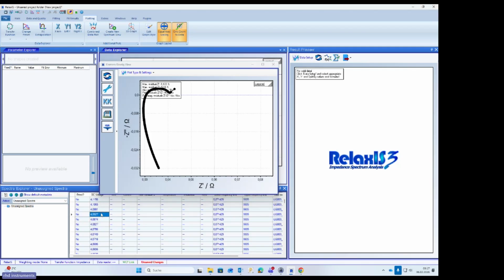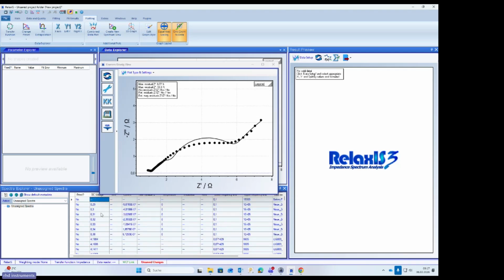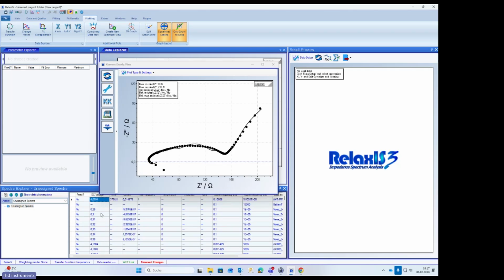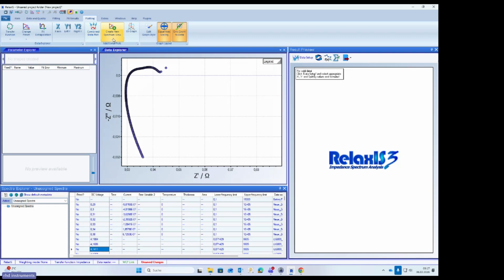And if I go here now through these different data sets, you see here Kramers-Kronig is fulfilled for most of them. Maybe not here. In this case, we have some issues with Kramers-Kronig, but for most of the data sets, we have Kramers-Kronig being fulfilled. And what you also have is here, oh, sorry, I didn't want to close this window.